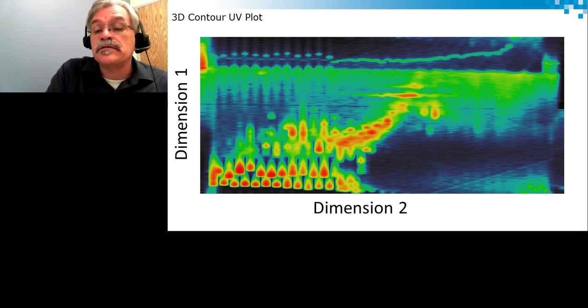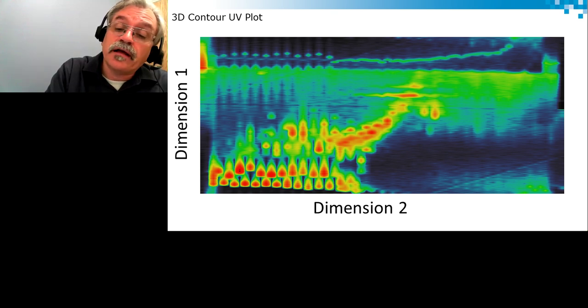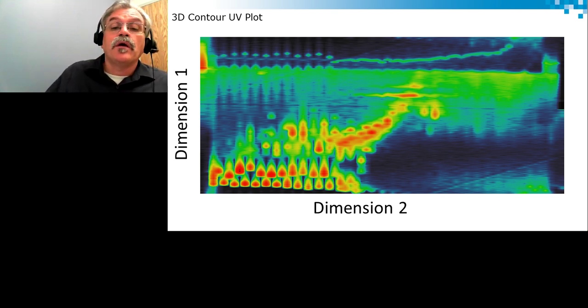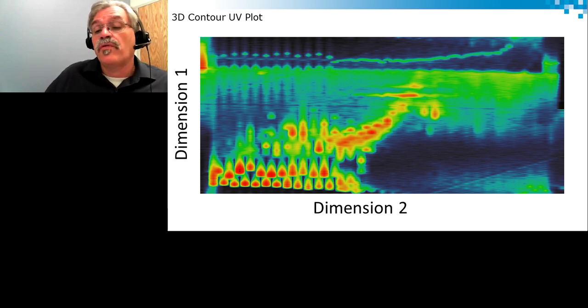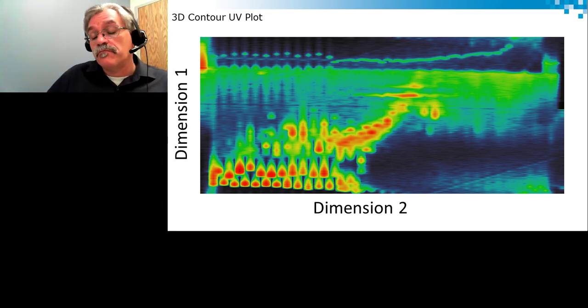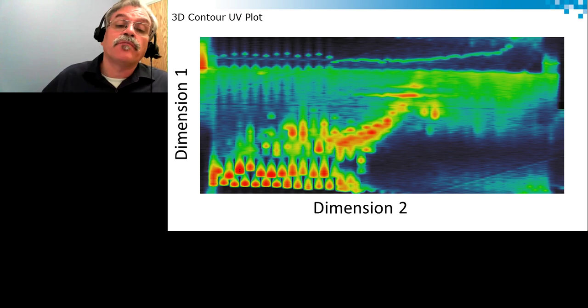Now, one aspect of comprehensive chromatography, in this case, is that it's one of the first iterations of this technique, and we can see that it does increase the peak capacity or resolution capacity. Most of the time you're still going to have a lot of tailing. You can see that in the bottom corner, peaks basically look pretty wide. This is actually nothing more than adding a resolution factor. It's pretty significant, but more can be done.